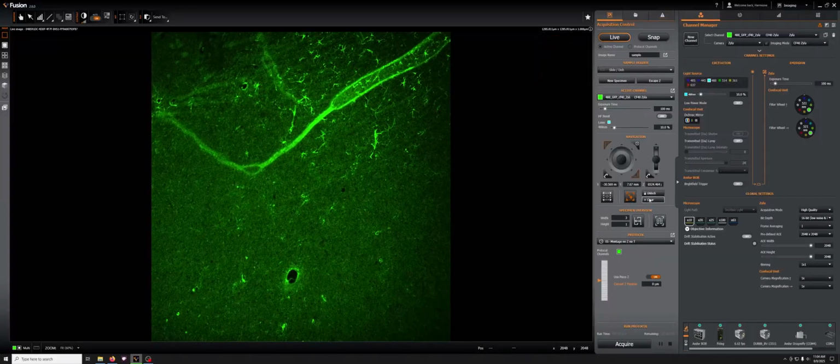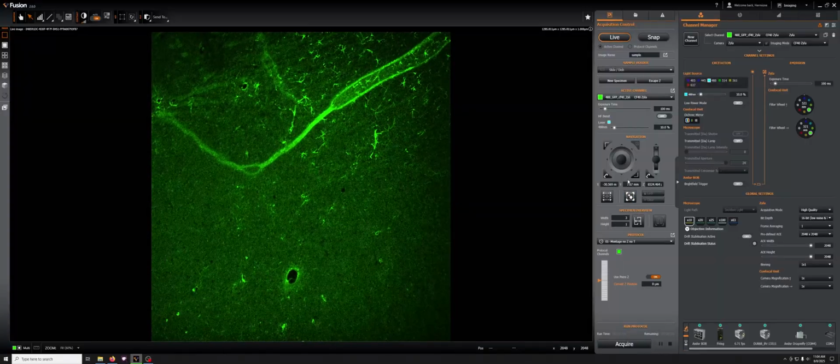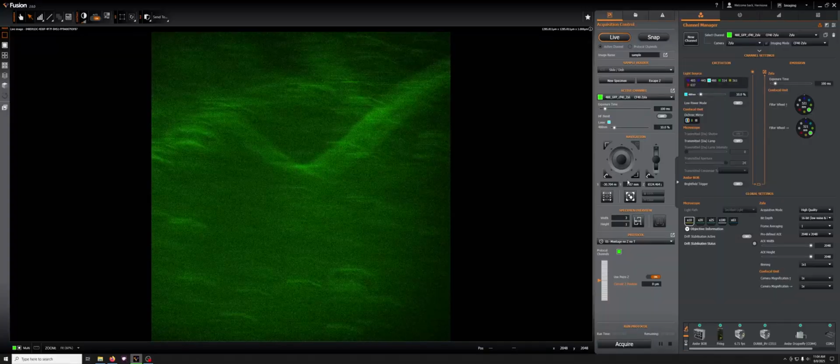So I don't find the boundaries thing that useful, but it is useful sometimes to be able to mark a larger region either by hand using this, or in a way I'm going to show you in a second, which is by marking the corners. That can be useful sometimes to scan something rather large, and it can be easier than doing it with this, where you sort of have to guess at the width and the height. So let me clear everything I've done, turn off this, and just show you how to mark things by marking the top left and the bottom right corner of the area to scan.